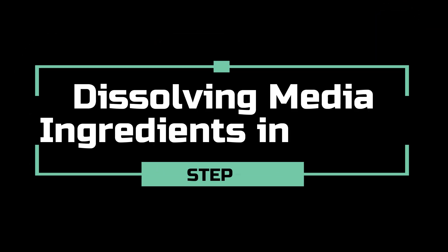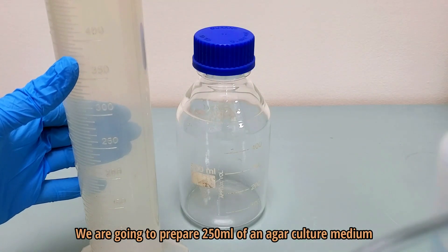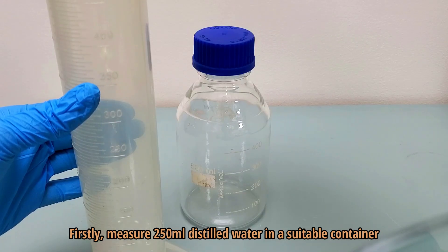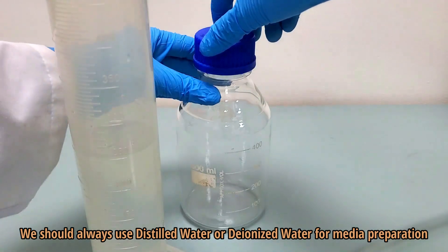In the first step, we are going to dissolve media constituents in purified water. In this video, we will prepare 250 millilitres of an agar culture medium. Firstly, measure 250 millilitres of distilled water in a suitable container. We should always use distilled water or deionized water for media preparation.